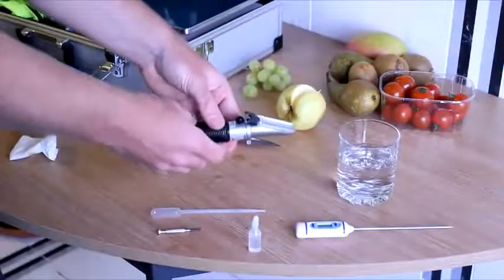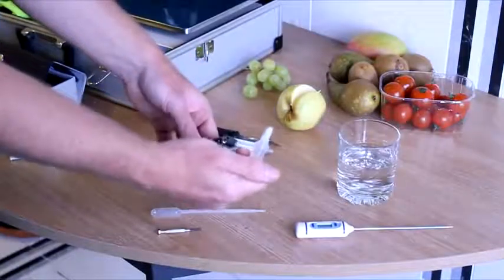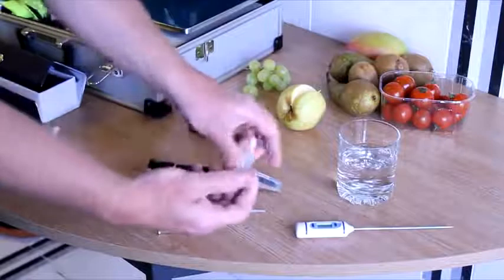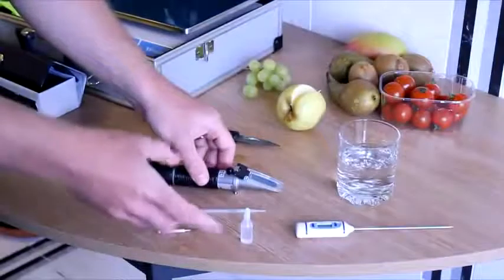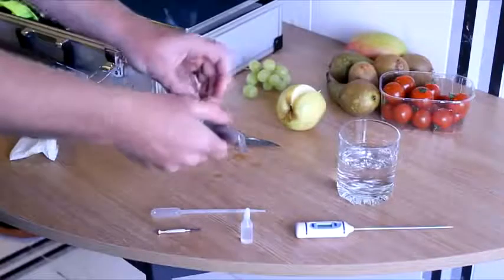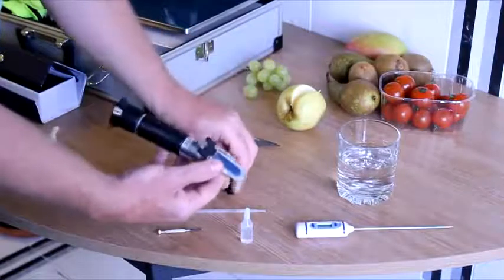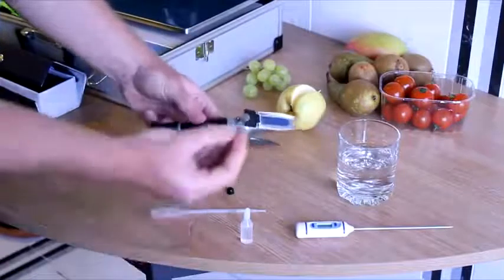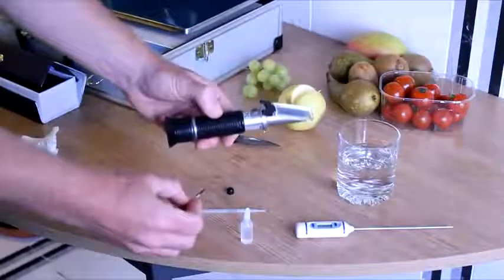To calibrate your equipment, we use solutions that are either distilled at 0 or a fixed percentage. You simply add them as you would a normal fruit sample, and the reading you get should be exactly that listed on the bottle. If you find the equipment needs calibrating, you can simply remove the black cap and use the small screwdriver provided in the kit to adjust your scale in either one direction or the other. Very simple.